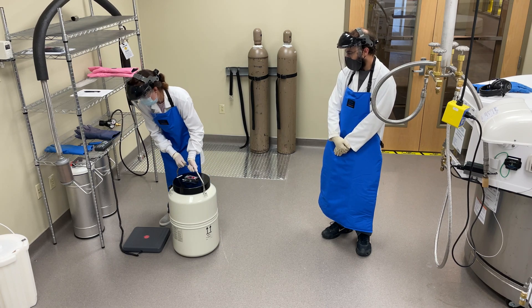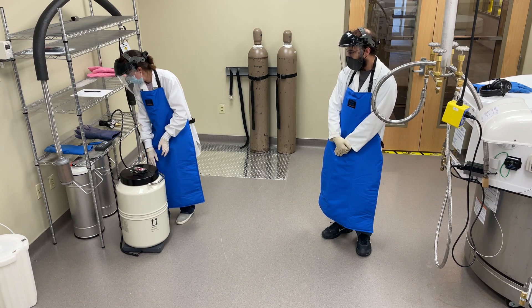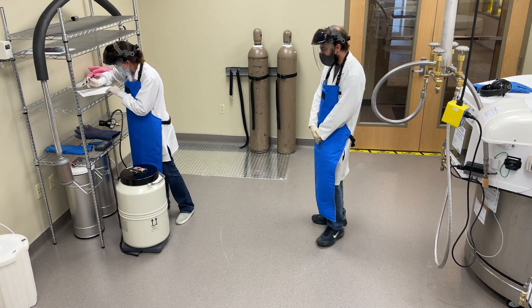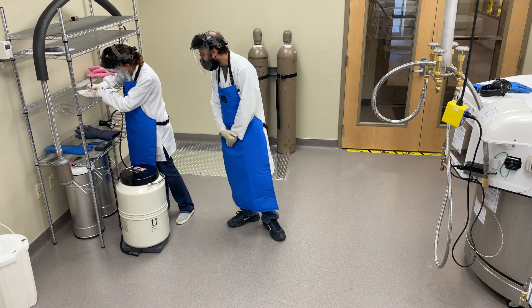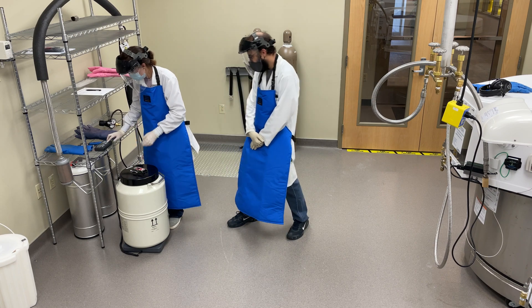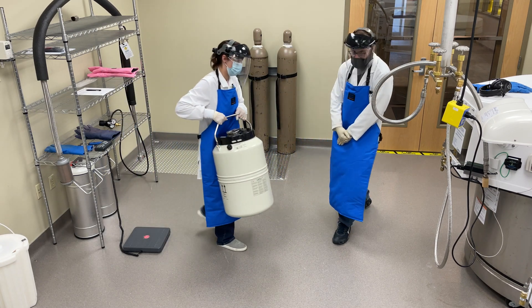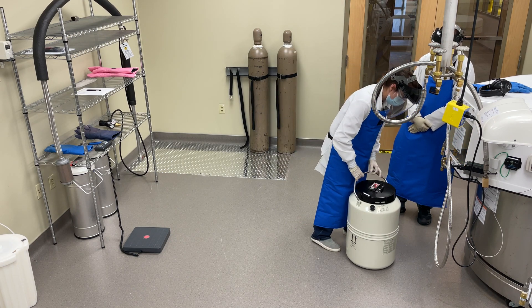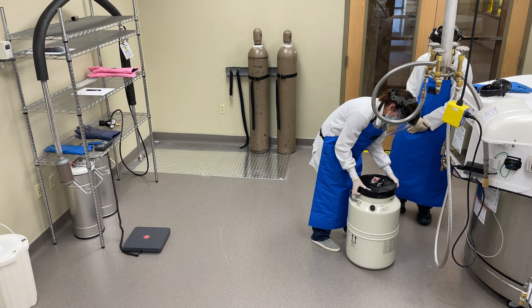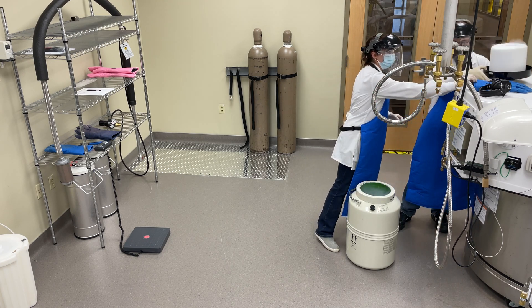First, record the empty weight of the cryoshipper. Then remove the foam cap from the top of the dewar.